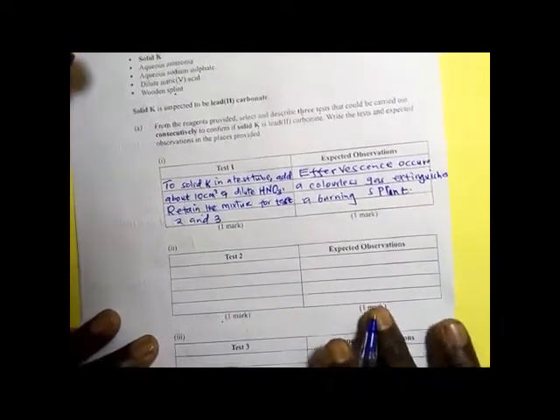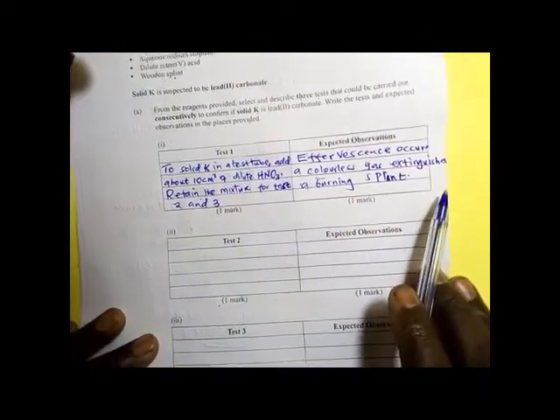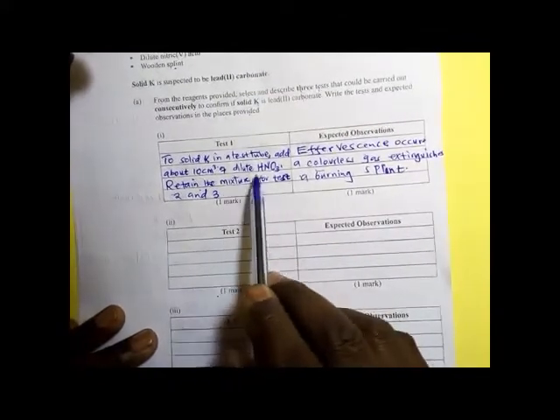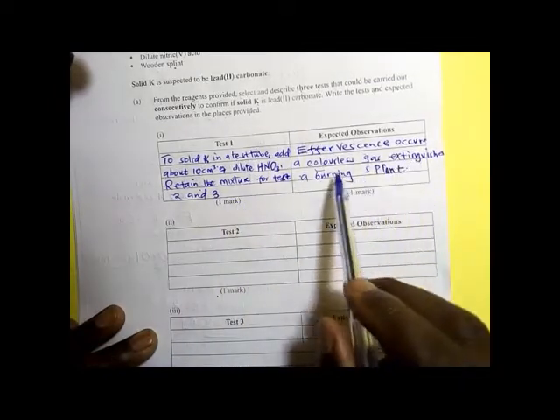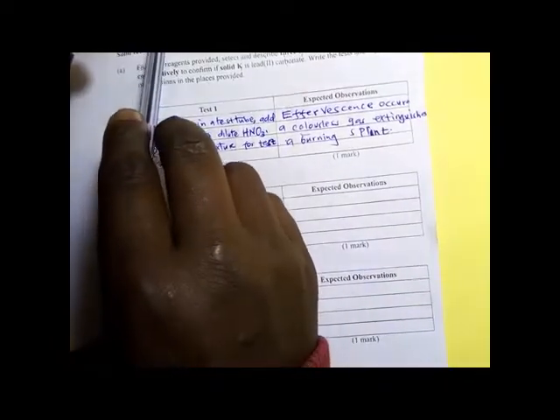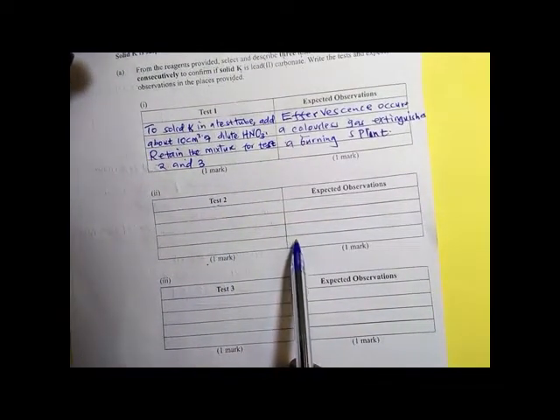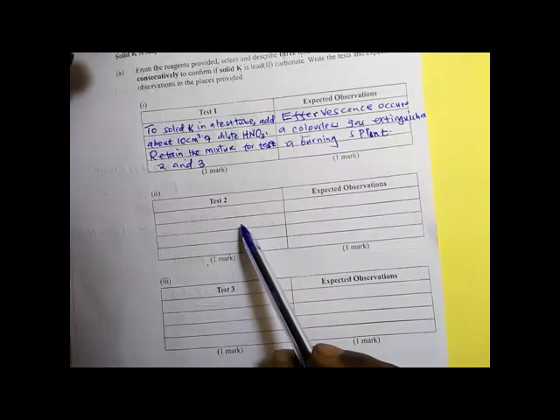Let us go to test number 2. These are the things we need to confirm: that this one will produce effervescence, and effervescence is produced because of the carbon dioxide gas that will extinguish a burning splint when it is introduced to it. Test number 2. Now we have the reagents aqueous ammonia and then sodium sulfate. You cannot use the aqueous sodium sulfate before you use ammonia. So ammonia will come before the sodium sulfate.